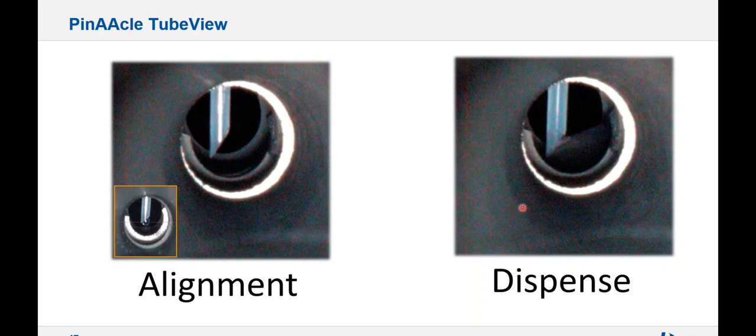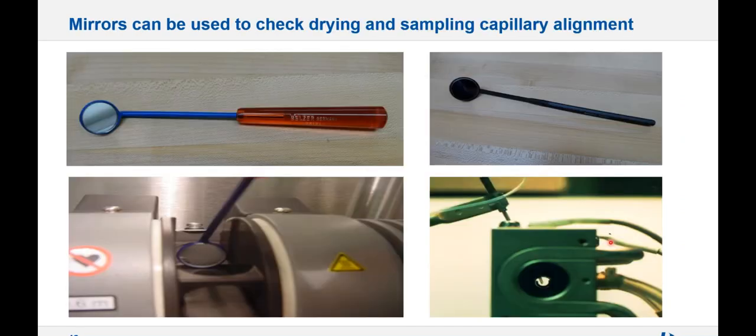And drying, even though you can see it dry to some extent with the camera, it's always best to verify drying by holding the little mirror over the dosing hole and looking at the vapor with the mirror. So this is an example of seeing the vapor coming off during the dry step. And this little mirror will fit very nicely, especially on the ZL furnace, but you can use it with the HGA furnace as well. You just have to hold it a little bit at an angle.